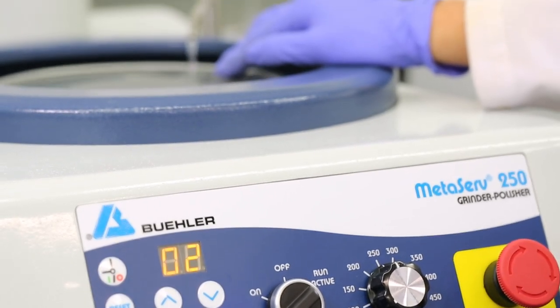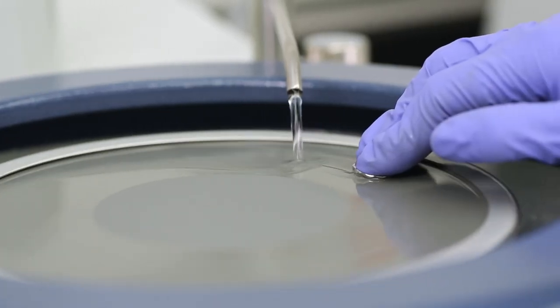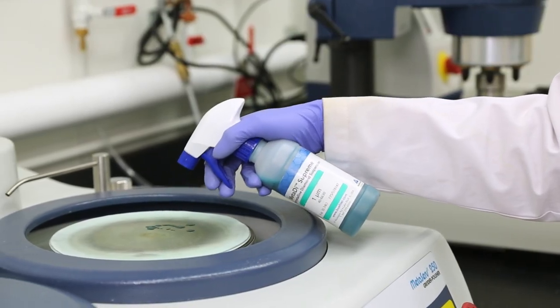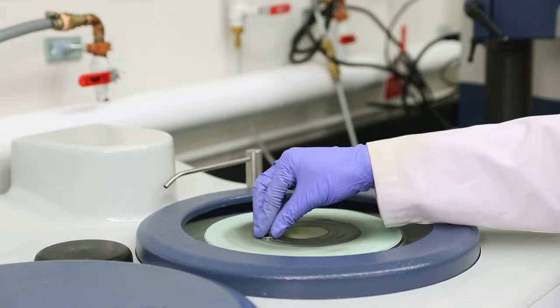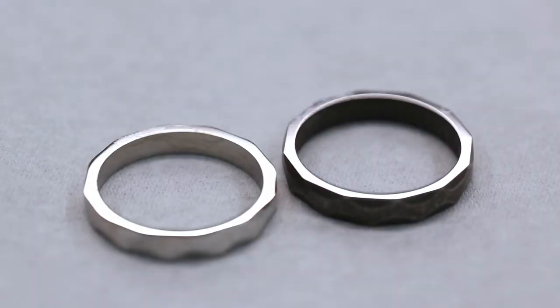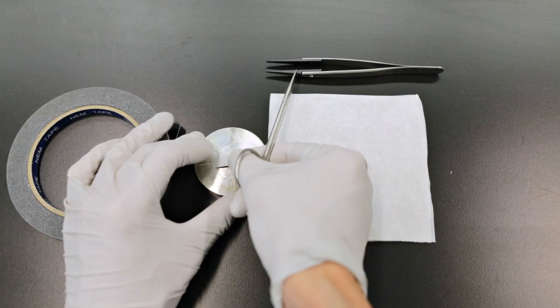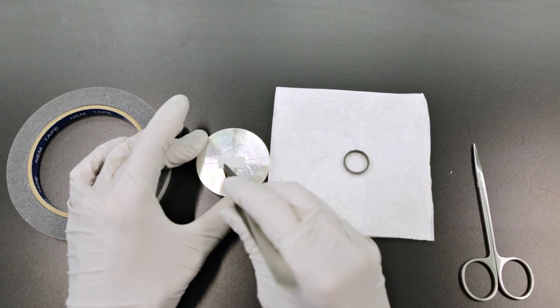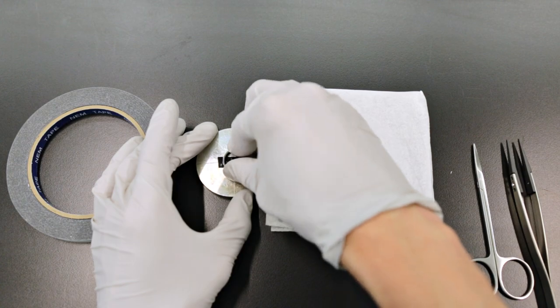Since the rings have been previously worn and are full of scratches, the rings have to go through a multi-step grinding and polishing procedure using sandpaper and fine diamond paste before observation in the scanning electron microscope. The final result should be a clean mirror finish free of scratches. Afterwards, the ring is mounted on a specimen stage using double-sided conductive tape and is now ready for observation in the scanning electron microscope.